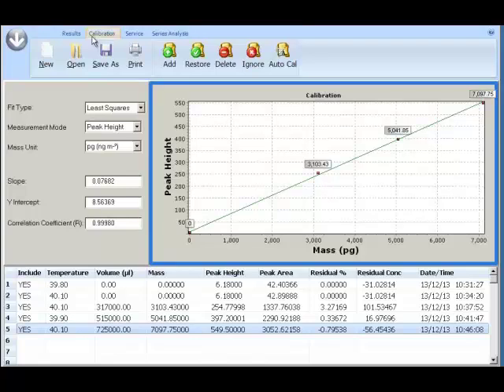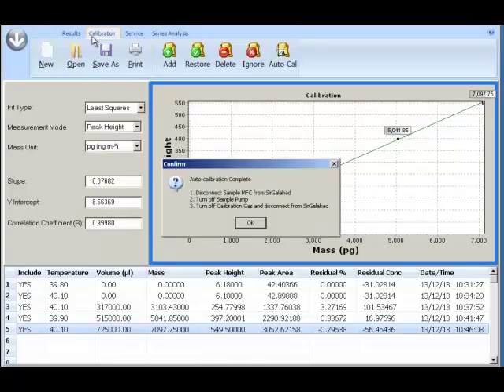Once calibration is finished, it will prompt you to disconnect the mass flow controller and the CavKit. Disconnect the sample mass flow controller from Sir Galahad. Turn off the sample pump. Turn off calibration gas and disconnect from Sir Galahad. Then press OK.